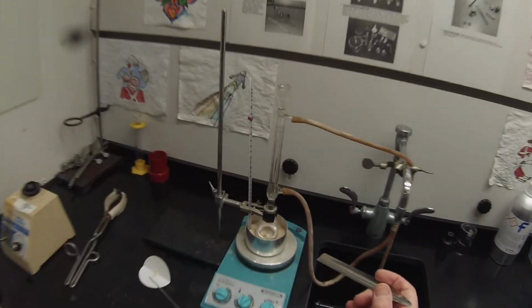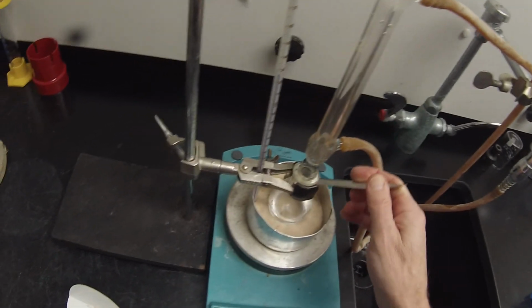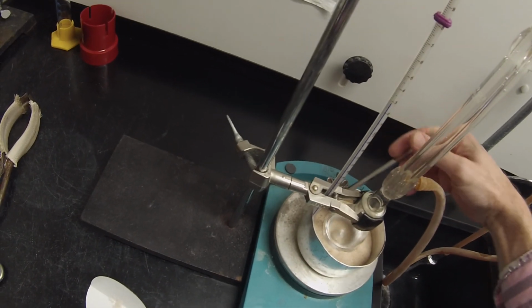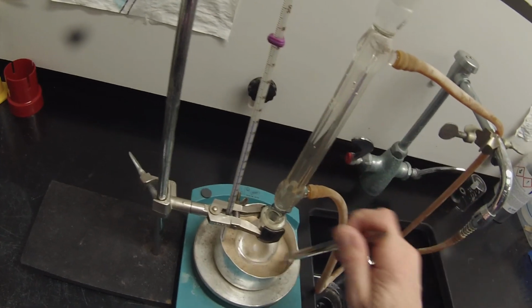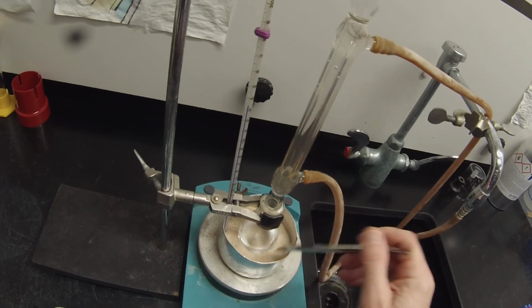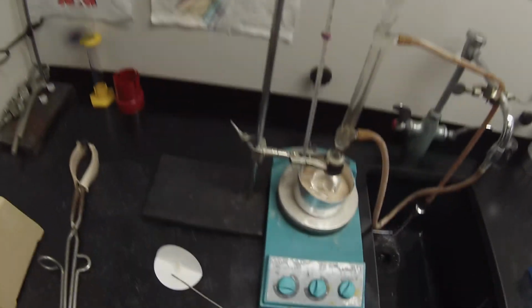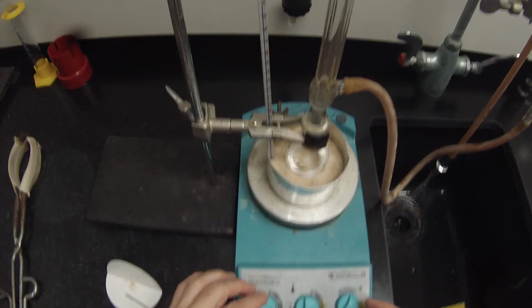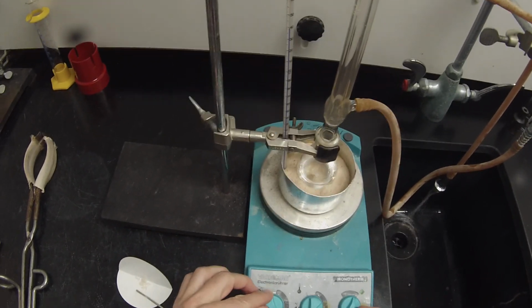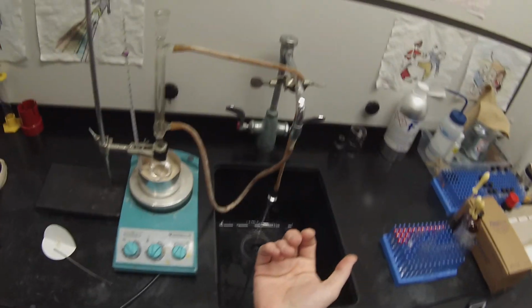Now we'll use the scoop to kind of scoop the sand so that it's got as good a contact as we can get to the surface. So that'll get that boiling. We're at 250 there, we're at about 450. You can even go up to 600. Should be able to handle that stir rate.